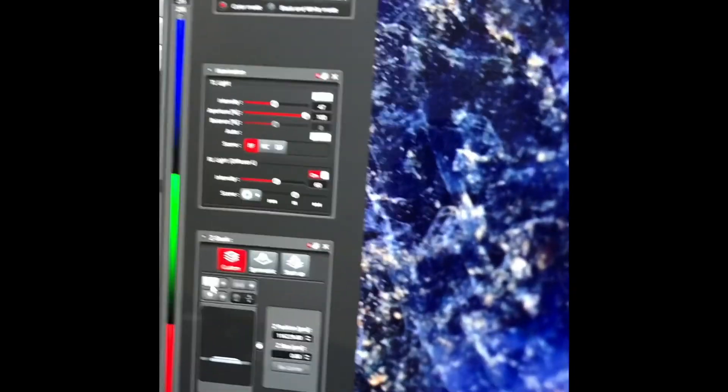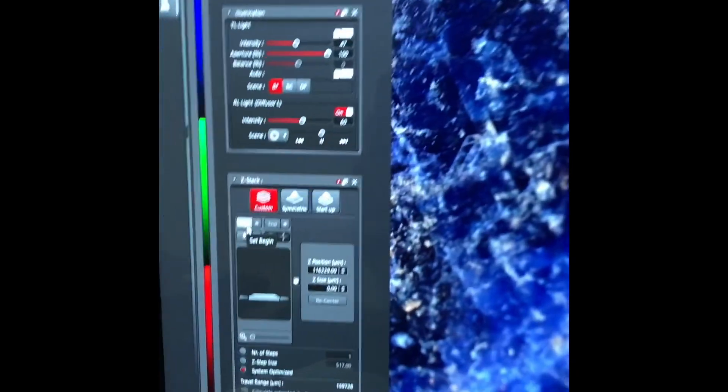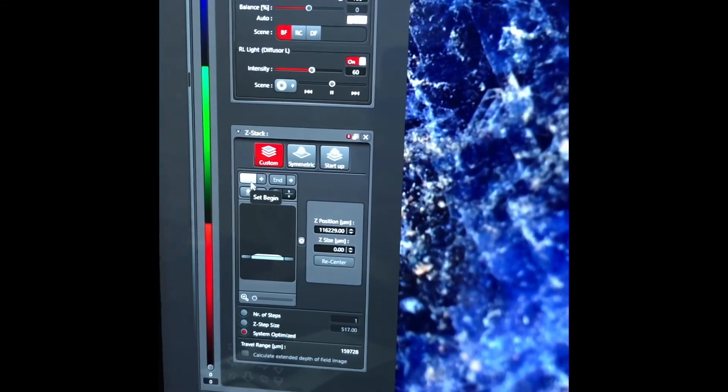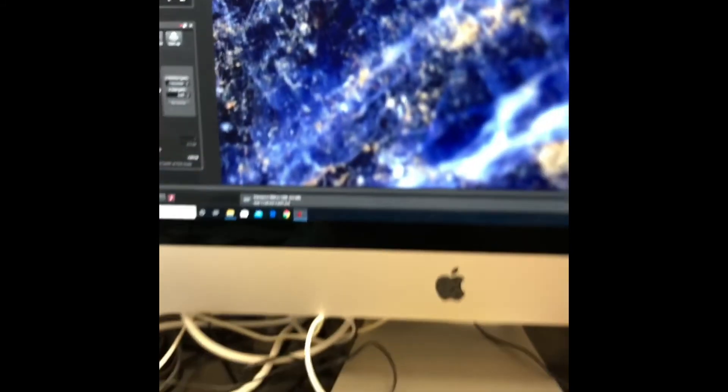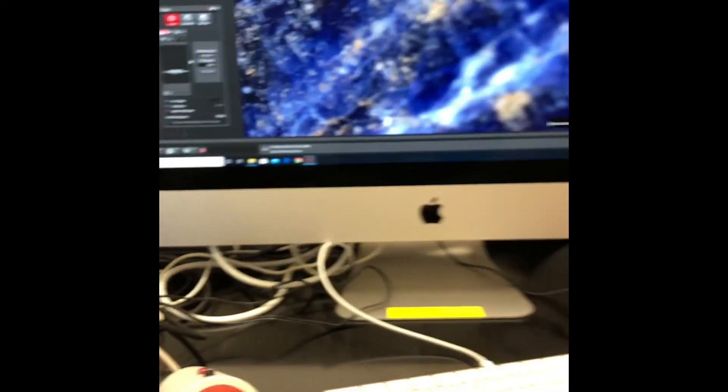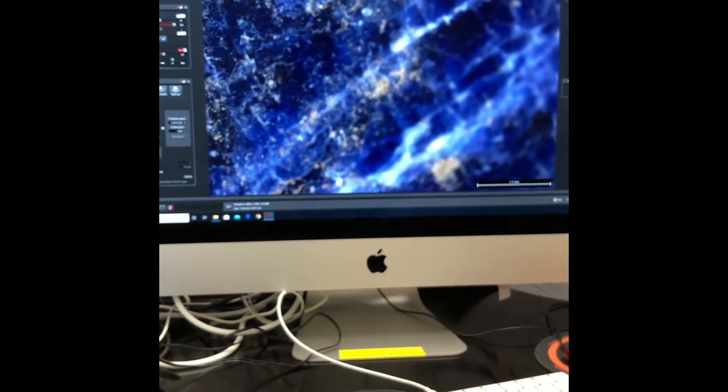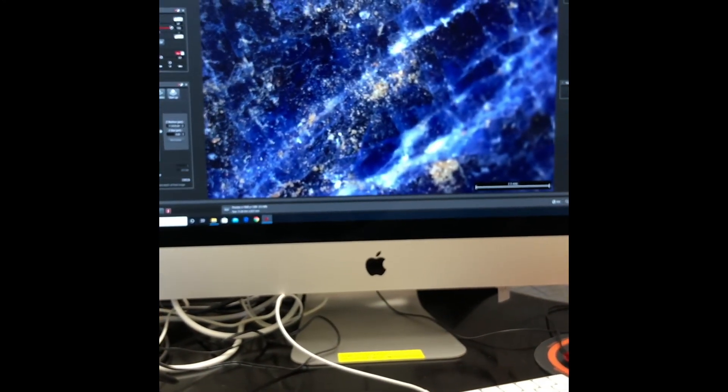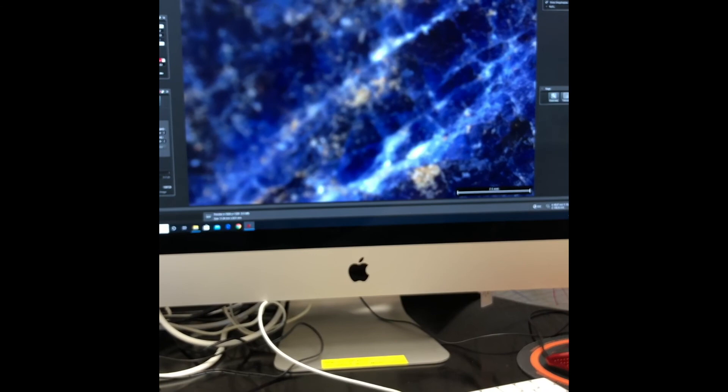To start, since we already have this area in focus, we're going to press begin. Then with the focus knob, we're going to get the other section into focus.